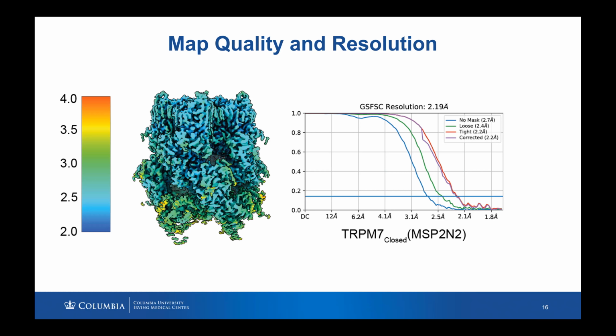Oh yes. So there are channels where cholesterol is absolutely required. Again, this is in my experience. For example, TRPM6. You can see not one, not two, but 3 different spots for cholesterol binding. And if you don't add cholesterol or cholesterol homologues when you do protein purification, you will end up with 0 yield. So yeah, it is very important for some channels, but for some TRP channels, it looks like it doesn't do much.